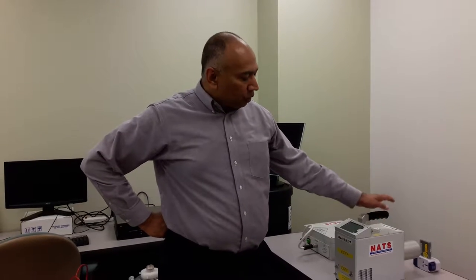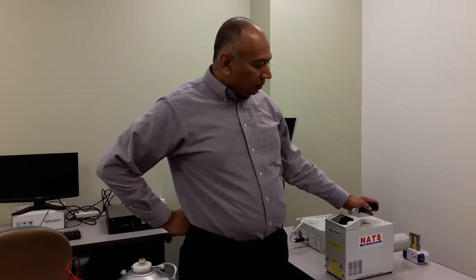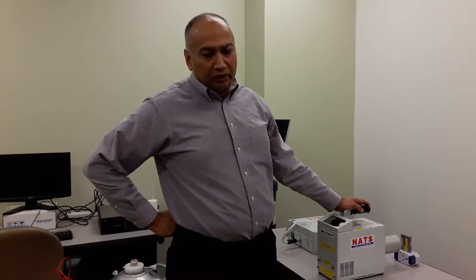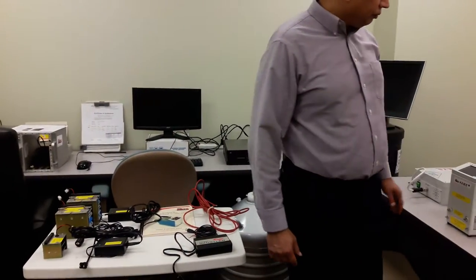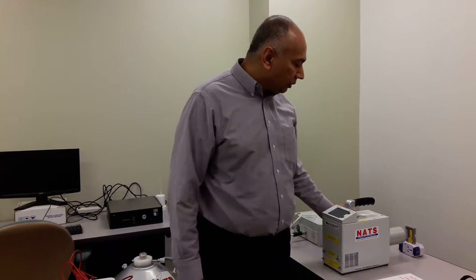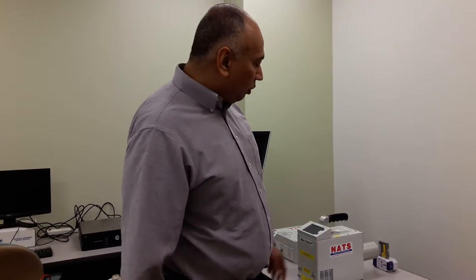Good morning, this is Ed Maxwell from Nats. We are going to make a couple of short videos to show you the basic operation of the Hawk Electric hand-spec portable radionuclide identification system based on a germanium detector. The purpose of this video is to give you a quick overview of how to start and operate the system, and also to give you some idea about what is included. Helping me is Derika from our sales department.